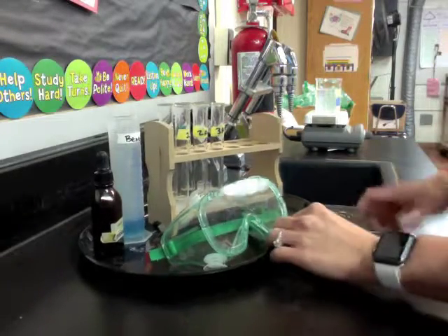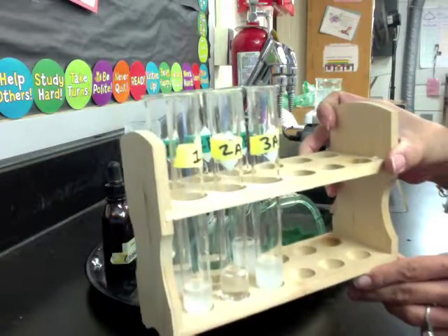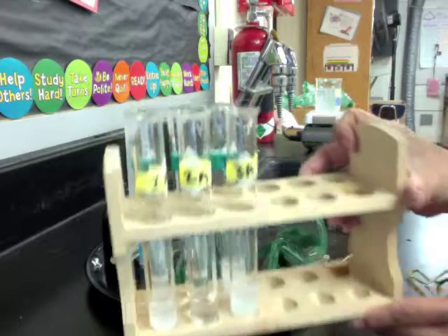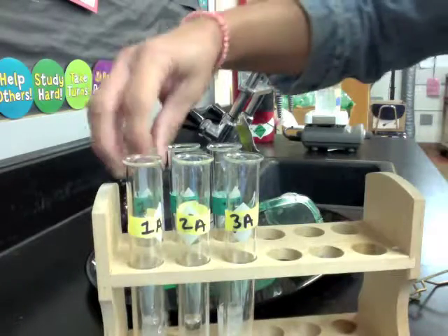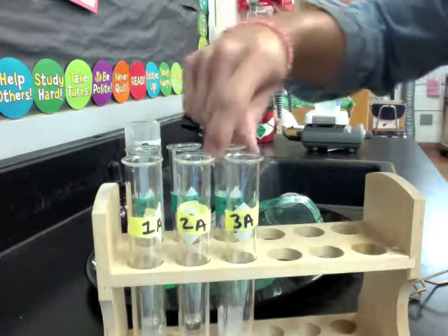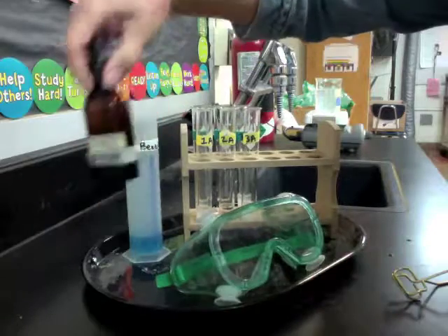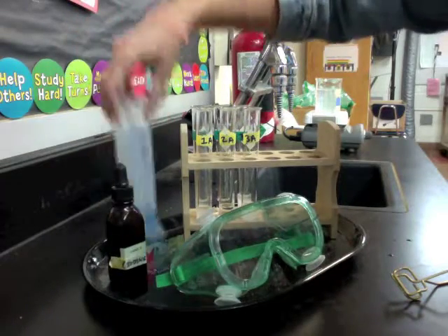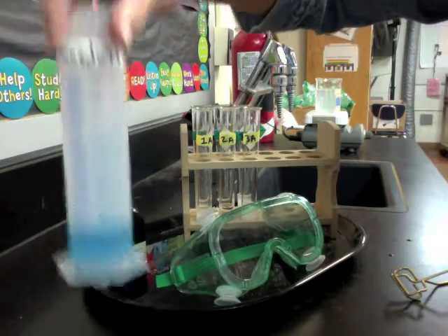So in today's lab, here are your materials. You're going to have a test tube rack, and in the test tube rack are six test tubes. They're labeled 1A, 2A, 3A, and then behind those 1B, 2B, 3B. They've been pre-filled with liquid for you to test. You'll also see that you have iodine and Benedict's solution, which are the two indicators we'll be using today.